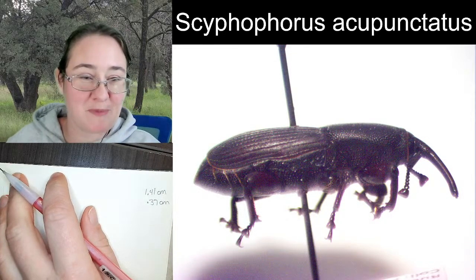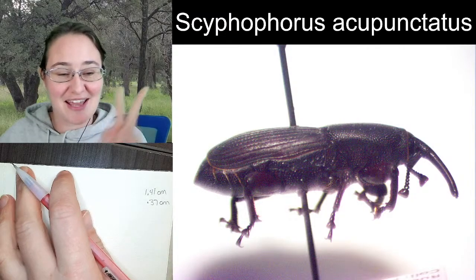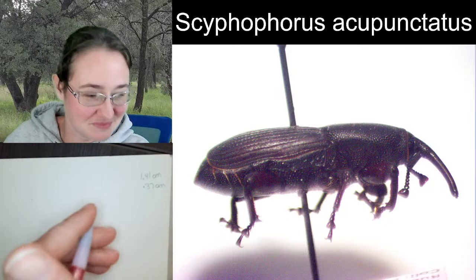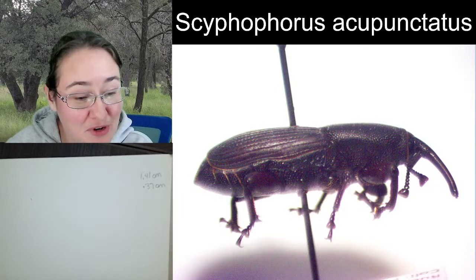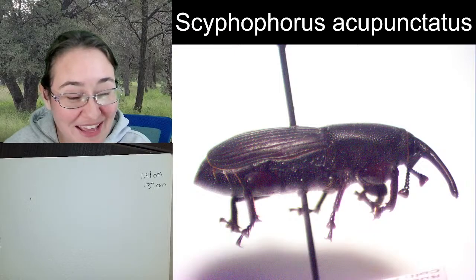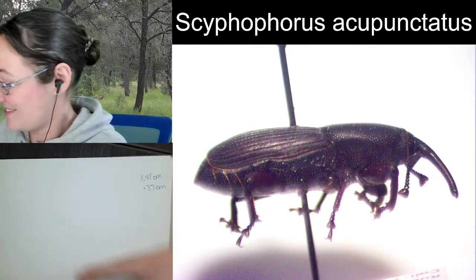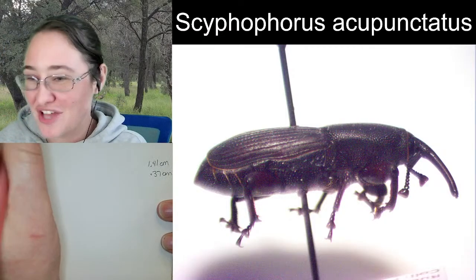Love a good tibial spine. That's true! The tibial spines are nice, and the tarsal claws are really good here. Well over. Summer of 2022. Oh, man! That's exciting. I should look into that.